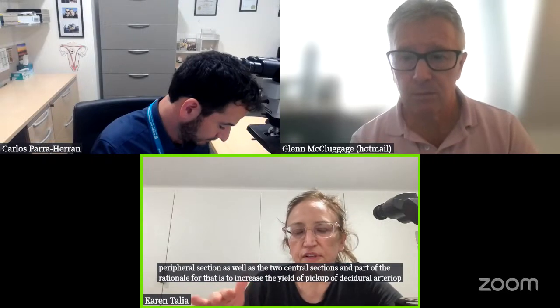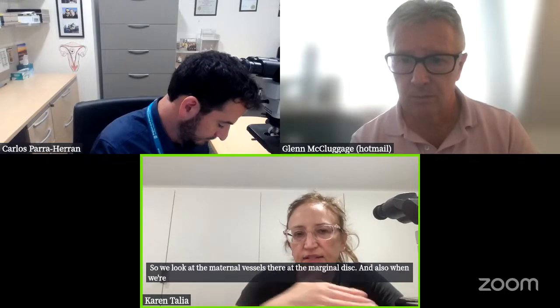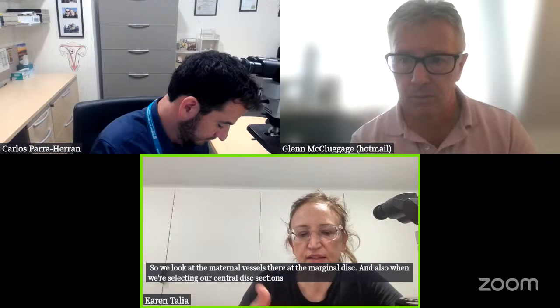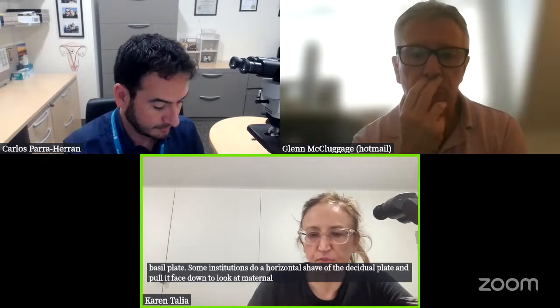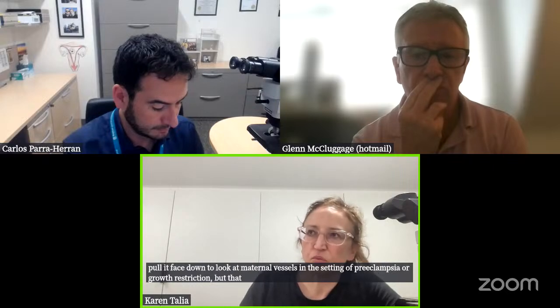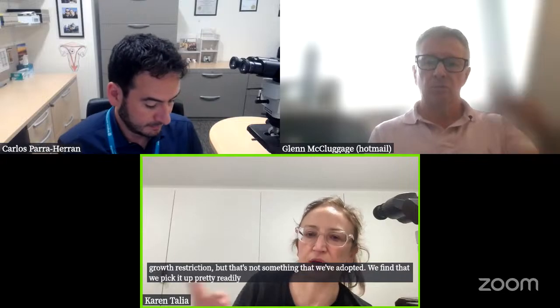So we look at the maternal vessels there at the marginal disc. And also when we're selecting our central disc sections, it's important to take the sections where the decidua is intact so that you can visualize the vessels in the central basal plate. Some institutions do a horizontal shave of the decidual plate and put it face down to look at maternal vessels in the setting of preeclampsia or growth restriction, but that's not something that we've adopted. We find that we pick it up pretty readily just using the methods I've described.